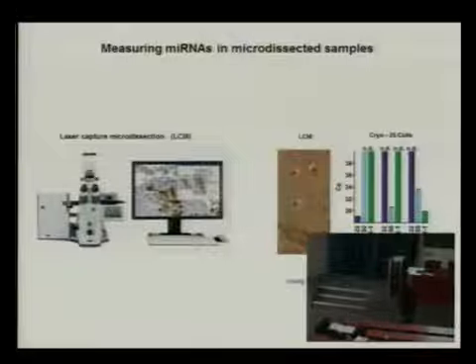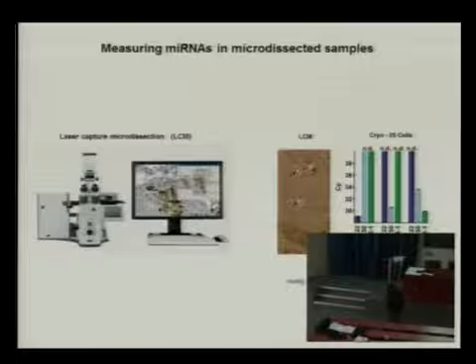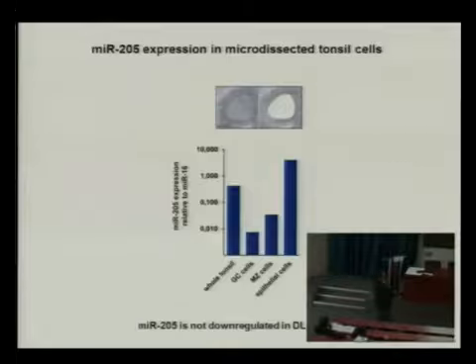And we took 25 cells and we microdissected some of them. And as expected, we find strong expression of microRNA 122 in the liver, 150 in the spleen, and the 1 in the heart. So that encouraged us to go on and dissect the individual tissues of the tonsil.